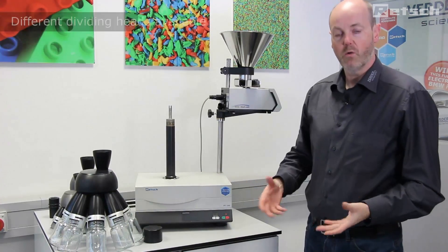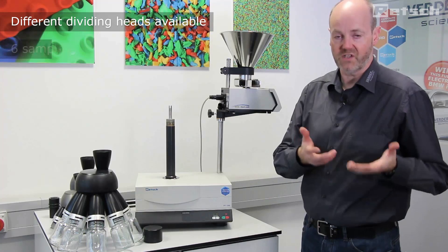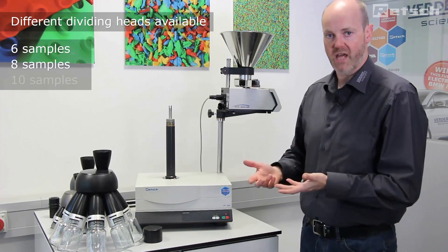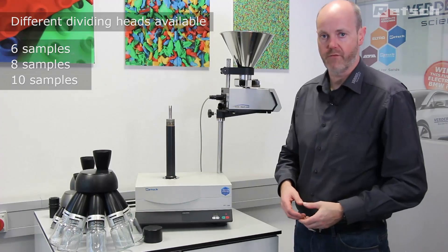If required, we offer dividing crowns with subsamples of six, eight, or ten outlets. Therefore, we can easily exchange them if required.